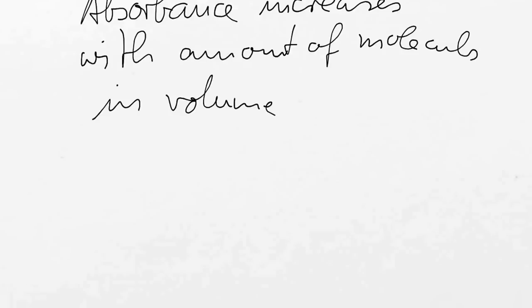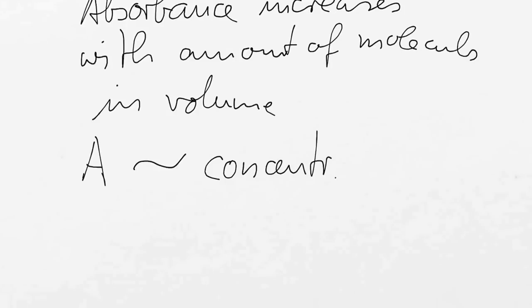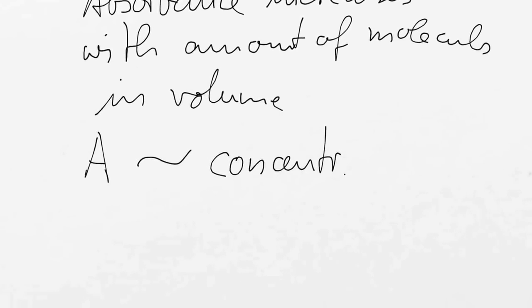It's a concentration. So what we can actually say is absorbance, and I just simply call it A, is proportional to the concentration of my substance. Does that make sense? Yeah? Absorbance is proportional, that's this wavy thing, is proportional to the concentration. Okay, great. I buy that.